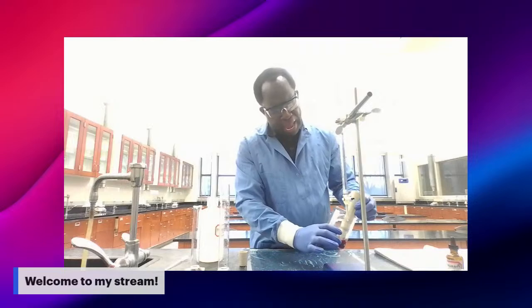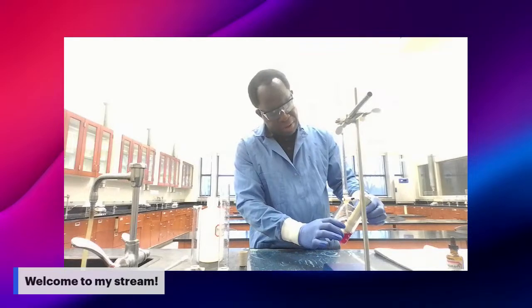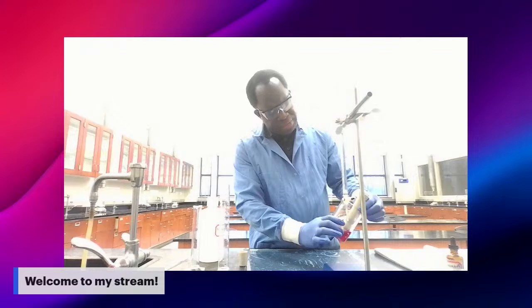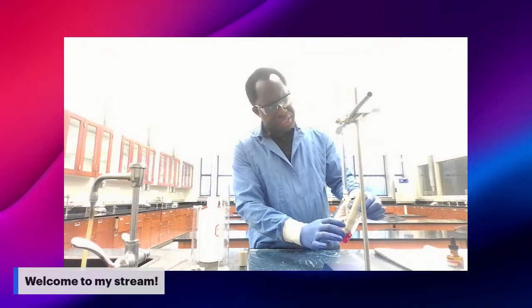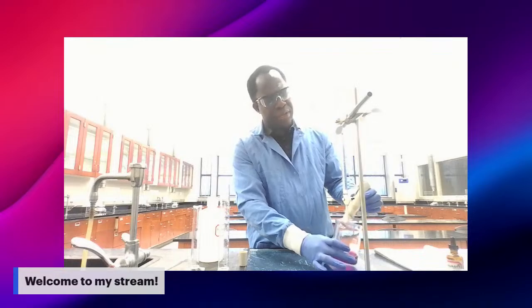For example, my pH right now, after my equivalence point, the first pH I'm measuring is 10.8.